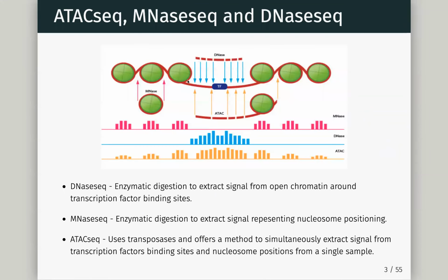Really anything which is, say this is the length of a nucleosome, anything which is 147 or above, we could assume is at least from one nucleosome, right? If I was to cut the open region here, I would have that bit of DNA wrapped around the nucleosome. If I unwind it, it's 147 long, right? So everything here could be anywhere between 0, I guess, and 147. We would consider everything up to 147 to be nucleosome free. We know it's not from a nucleosome. We might start to make the assumption once it's 147 and above, it comes from a nucleosome.